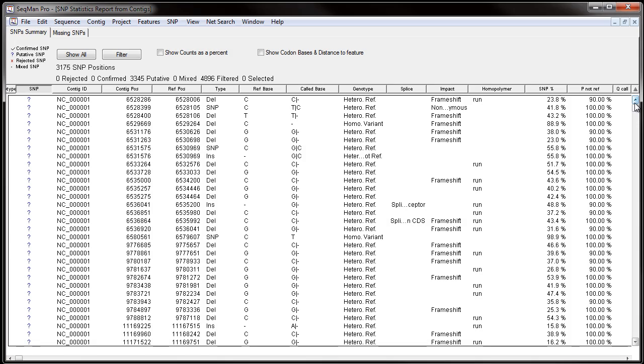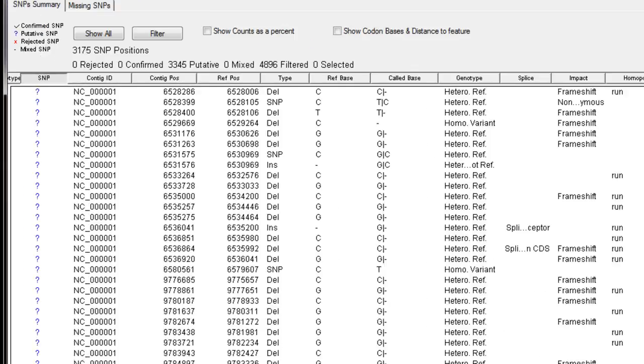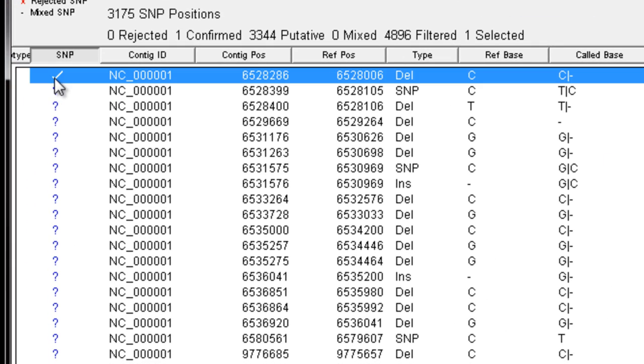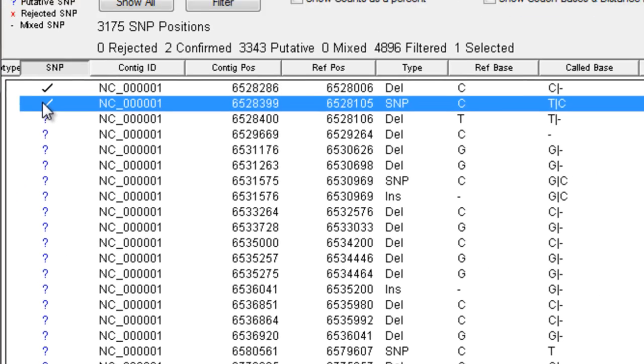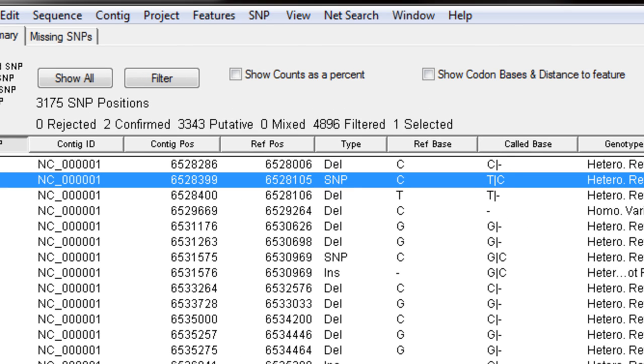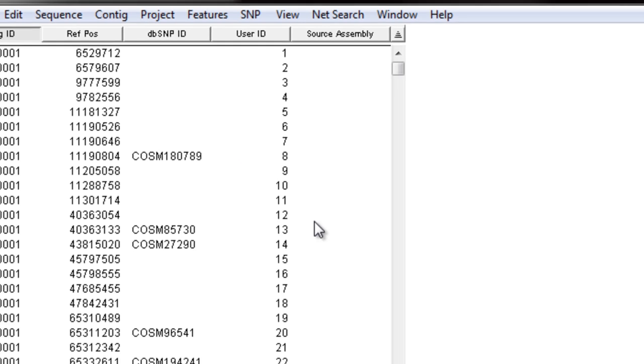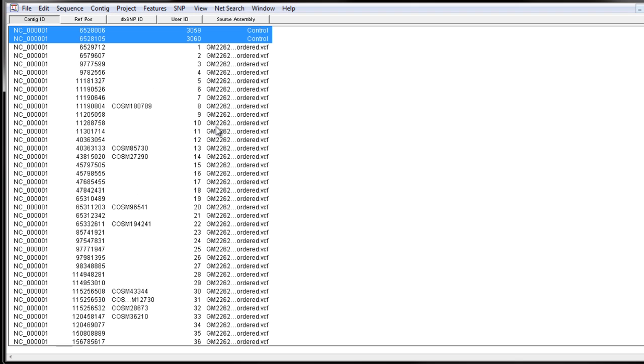If you want to add any of the found SNPs to the VCF file, simply click in the SNP column until you see a check mark, and then go to SNP, Append Check SNPs to VCF. This will add the SNPs to the VCF file for future assemblies.